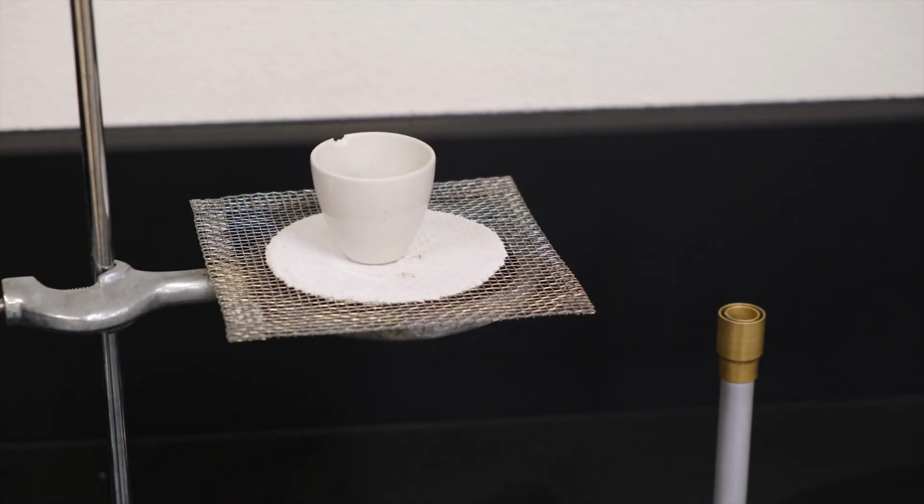One last thing before we get started. Just a reminder, your question today is, if we start with 5 moles of magnesium, how much magnesium oxide is produced? We're going to start the experiment now. I'll show you what the magnesium oxide looks like afterwards. But for now, let's get that burning started.